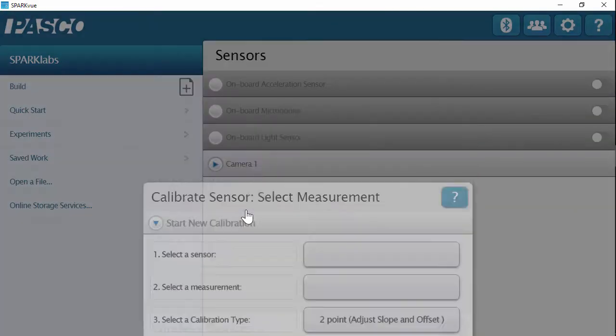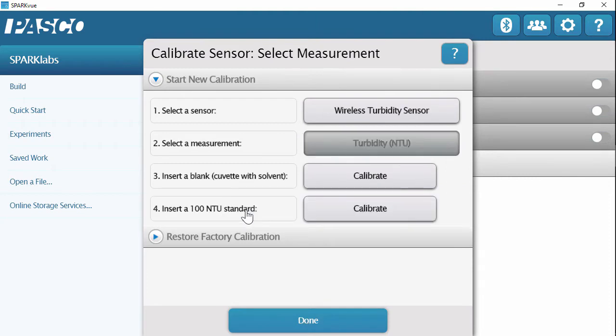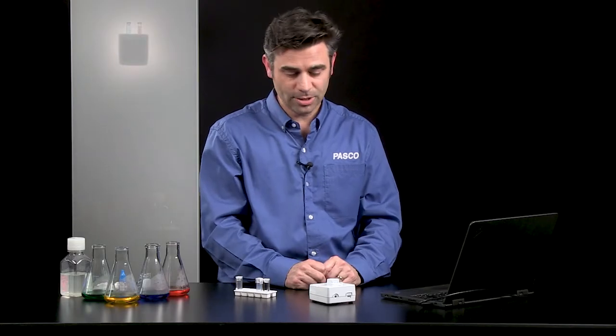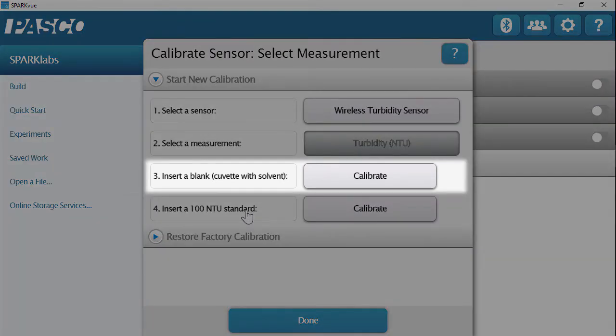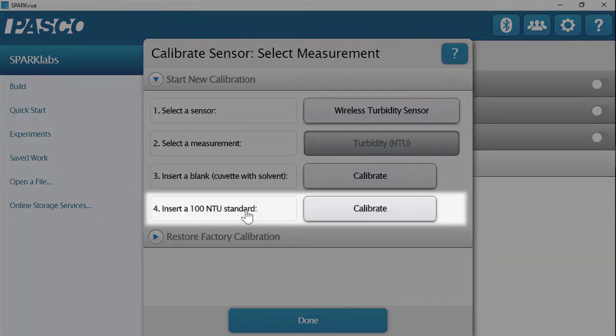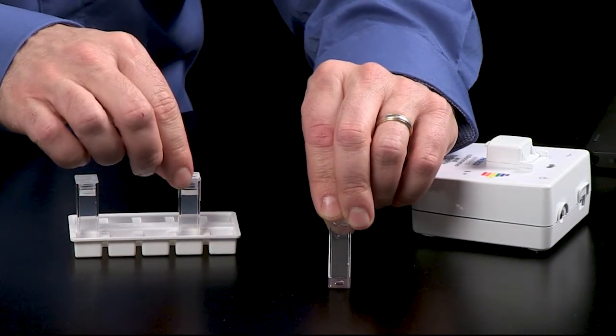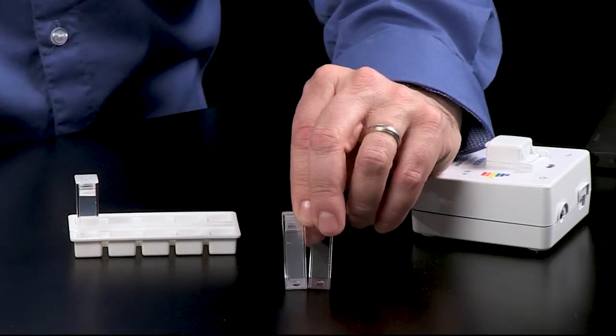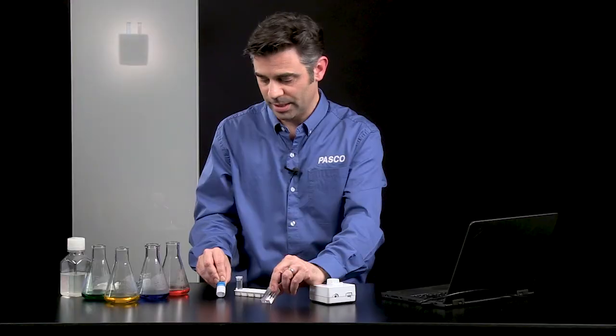I'm going to go in. Since I'm prompted, I'm going to hit calibrate. It is going to pop up the turbidity sensor or colorimeter. I want to make sure I'm calibrating with the turbidity sensor. And now it's going to ask me to calibrate with two things. I'm doing a two-point calibration with my blank and a 100 NTU standard. So my blank is distilled water, which is a 0 NTU standard. And this is my 100 NTU standard, and that came from this bottle, from the colorimeter and turbidity sensor box.